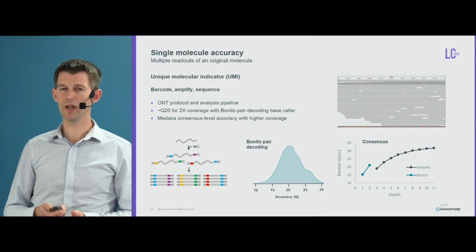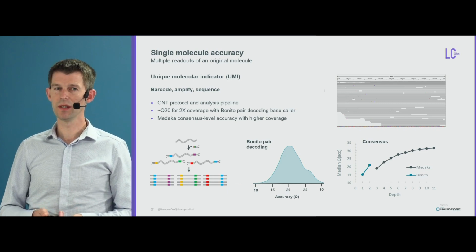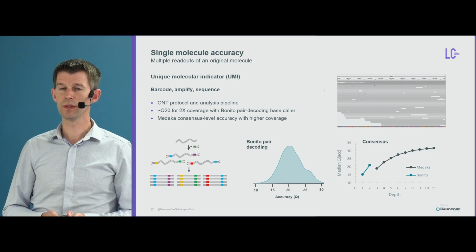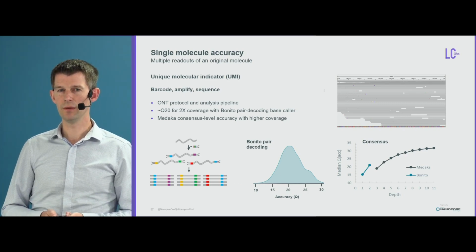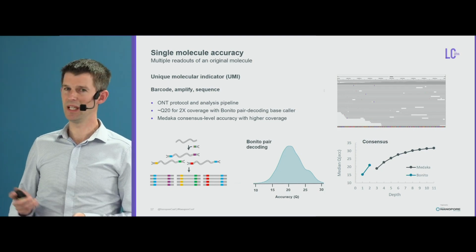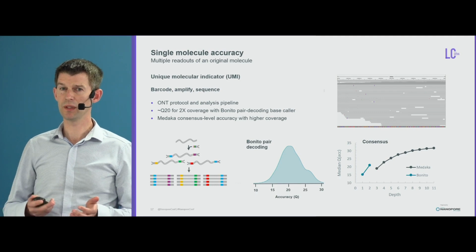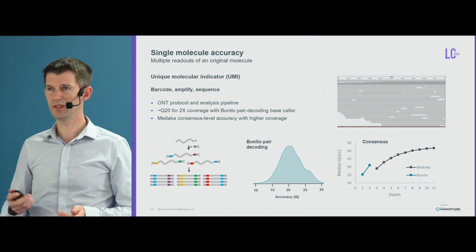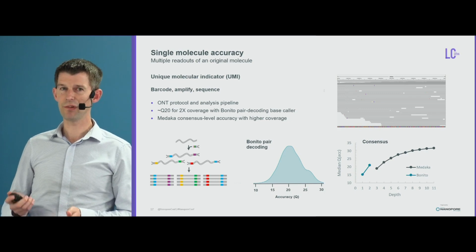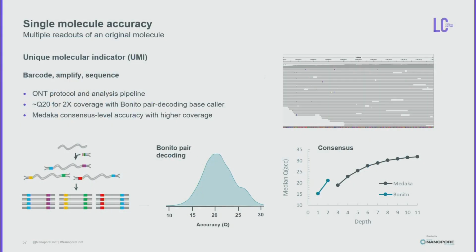Now this plot up on the right here is with the higher depth Medaka single molecule consensus results. I've switched off all the filters. You've got to be careful with other people's shots of genome browsers. There's various filters in there that have been built in for other sequencing technologies. We switch all those off here, so there's no quick consensus mode, there's no hiding of indels. You can see everything in that plot, and there are very, very few errors with single molecule sequencing there.